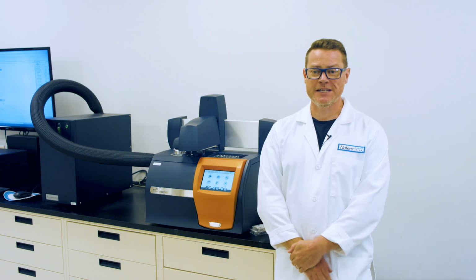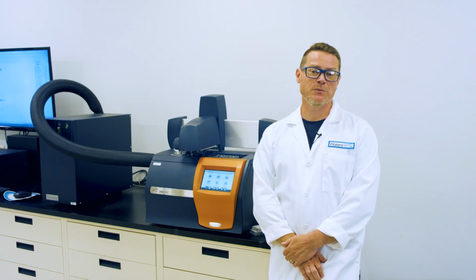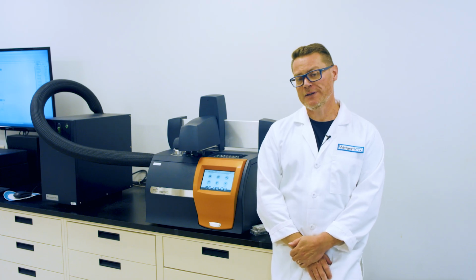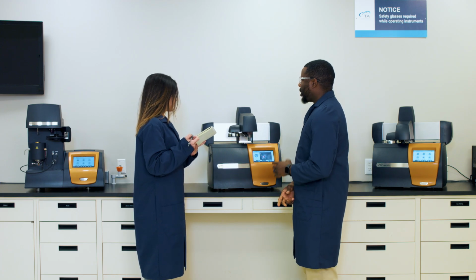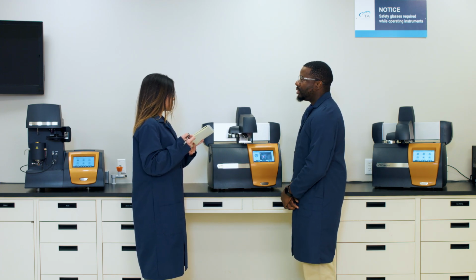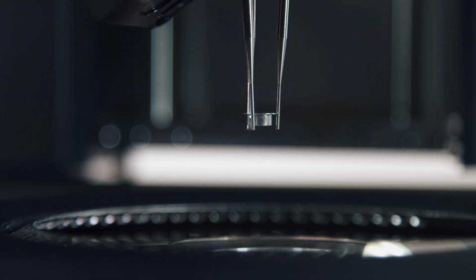There are many types of DSC instruments, so you should talk with your local product specialist to see which is the most suitable for your application. Clearly though, DSC is a very widely used analytical tool in many sectors, and that alone should tell you that the information it provides is very valuable.